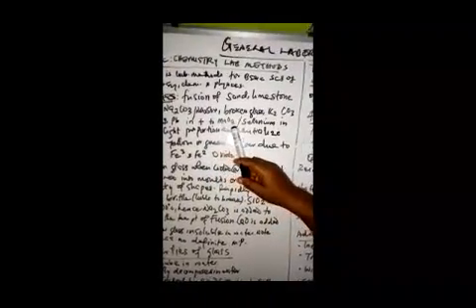lead, in addition to manganese oxide or selenium in light proportion. Why are you adding this and this? To neutralize the yellow or green color due to the presence of iron 3 and iron 2 oxide in the glass mixture.